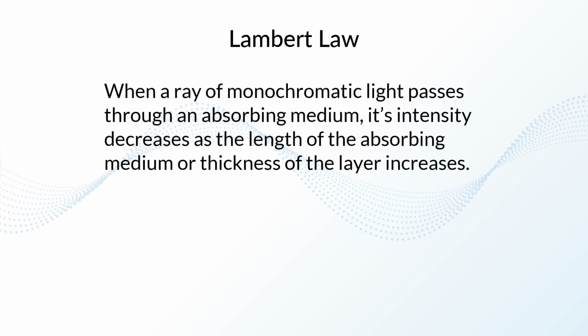So there's a Lambert law. When a ray of monochromatic light passes through an absorbing medium, its intensity decreases as the length of absorbing medium or thickness of the layer increases. Now we are talking about the thickness of the medium.